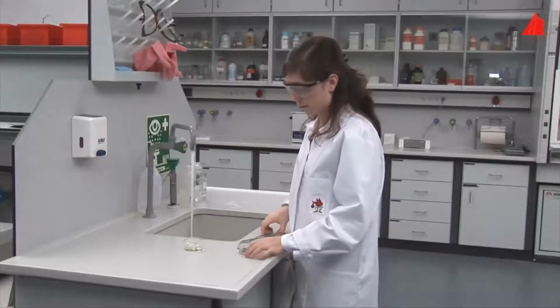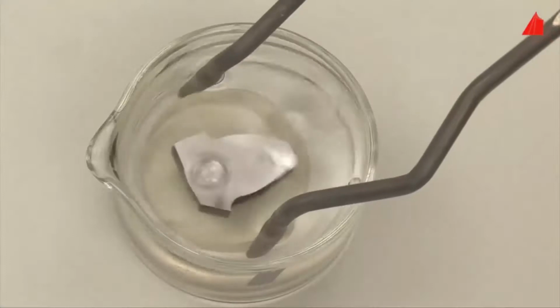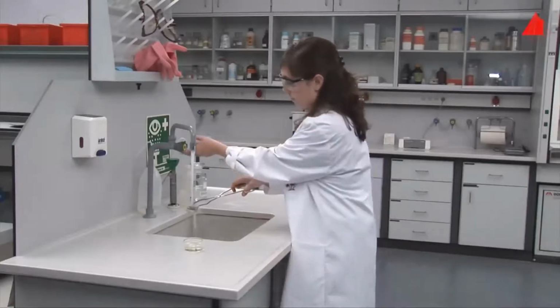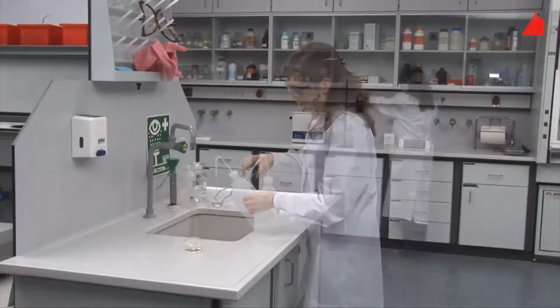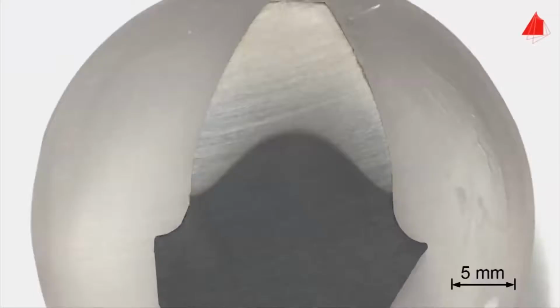She holds the mounted sample with pliers and immerses it into the etchant. After a few seconds, she takes the sample out again, washes it thoroughly with water, then with alcohol, and finally dries it with a hairdryer. Now the preparation of the flame-hardened tooth of a gear wheel is finished.